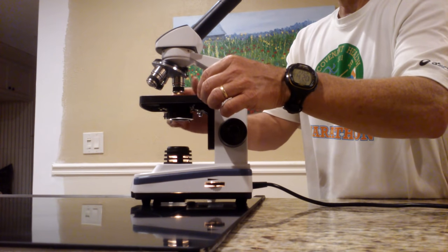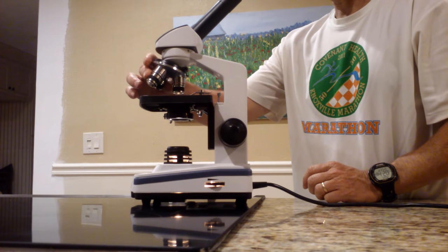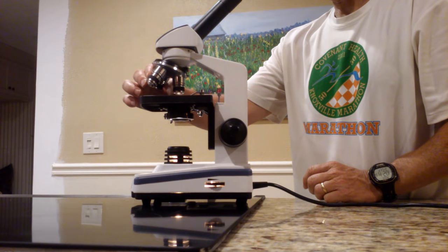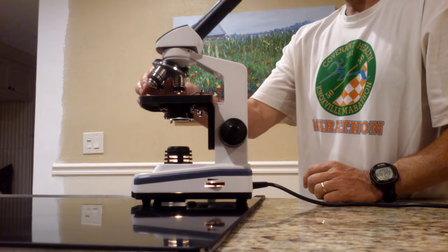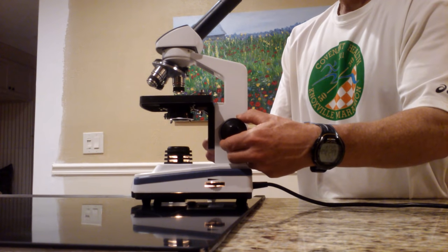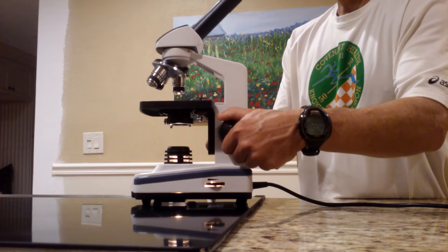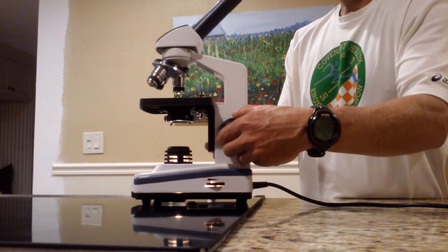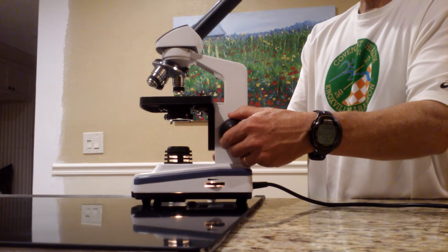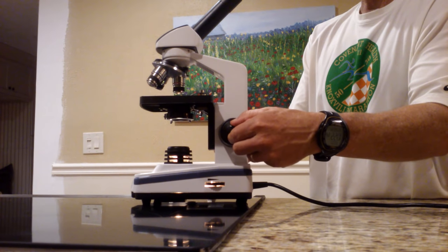So once you have it positioned, put the clips on. I always teach my students to start on the lowest magnification — on this particular microscope that is marked in red. Start with the coarse adjustment; you can see how far the stage moves when you turn it. Go ahead and get it close, and then when it is almost in focus you can use the fine adjustment to get it just right.